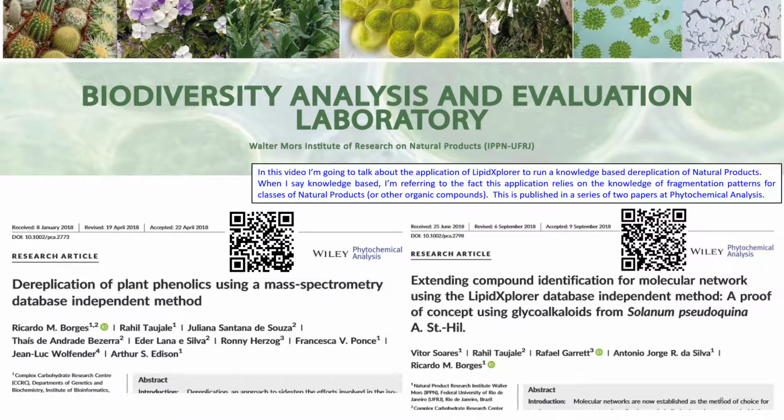In this video, I'm going to talk about the application of LipidXplorer to run knowledge-based dereplication of natural products. When I say knowledge-based, I'm referring to the fact that this application relies on the knowledge of fragmentation patterns for classes of natural products or other organic compounds.